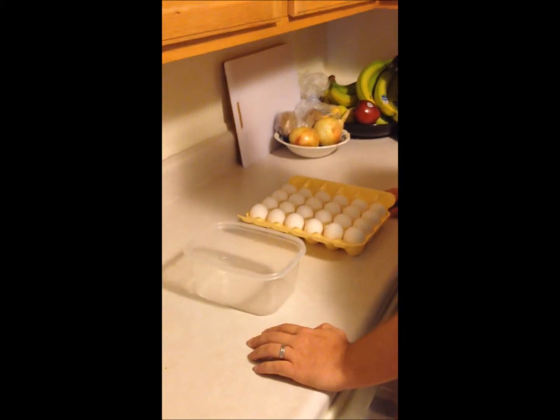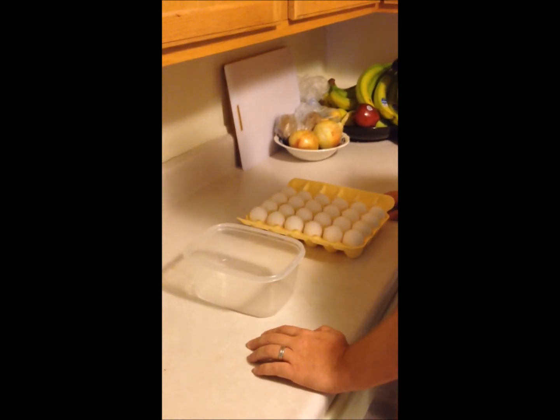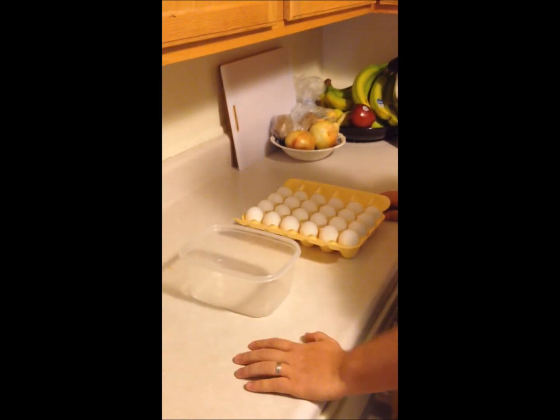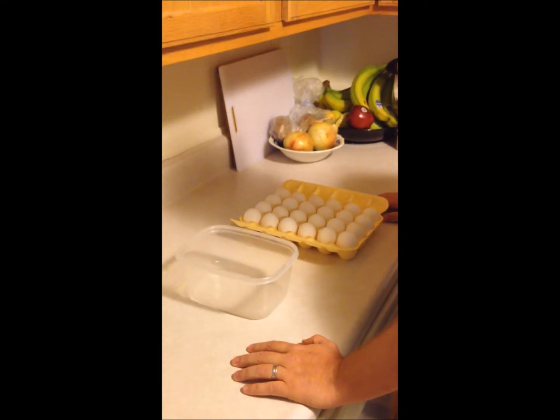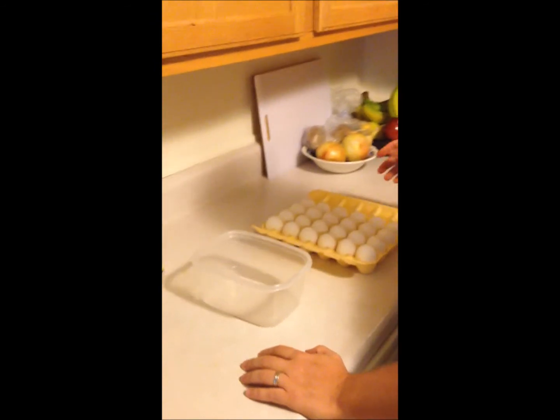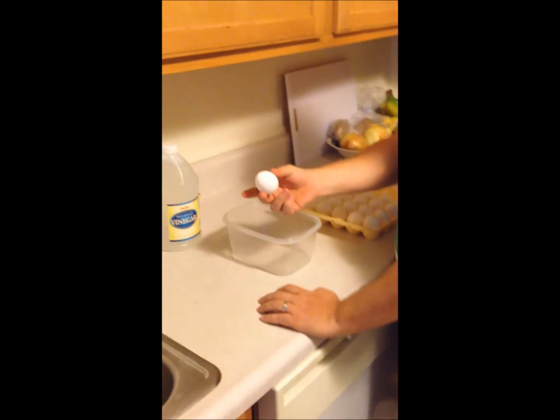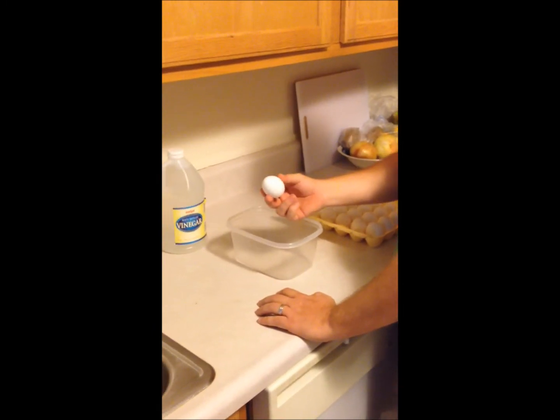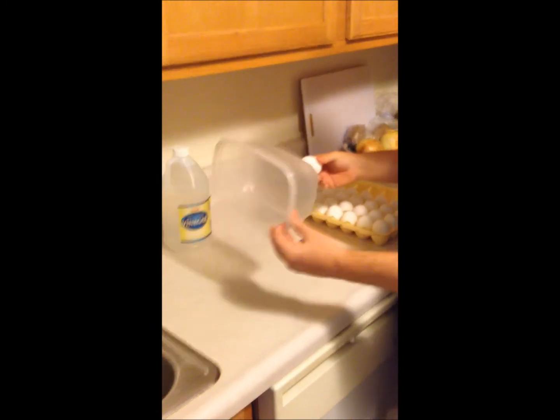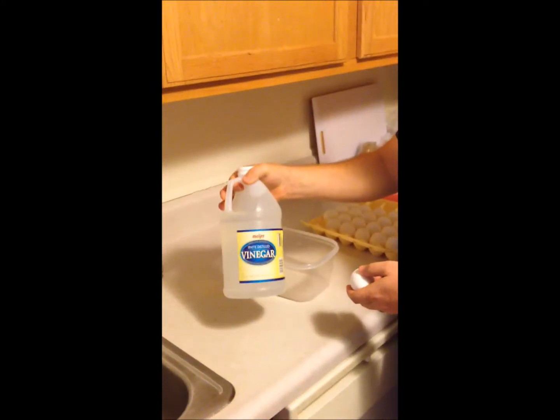The first step in the process for our egg experiment takes a few days, so I'm going to go ahead and get this stuff started and then it will all be ready to go for our experiment once we get into class. Pretty simple step — all you have to do is take a regular chicken egg you get at the store, put it into a container that has a lid, and let it soak in vinegar for a couple of days.